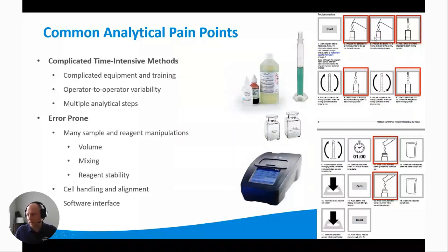And I didn't mention this, but in this traditional method, you actually have to do this entire procedure twice, because you have to measure a blank and then you have to measure the sample. So double all of these things in your head. There's addition of a reagent here, addition of reagent here, another reagent addition here, and all of these are opportunities for adding the wrong reagent, adding the wrong volume of reagent, and anything like that will cause an error in the result.